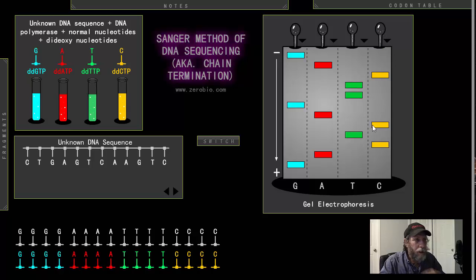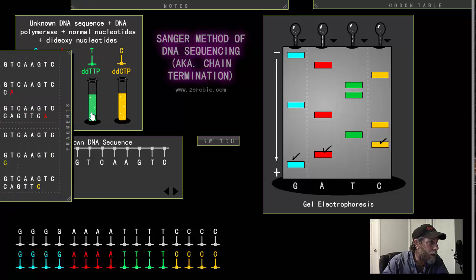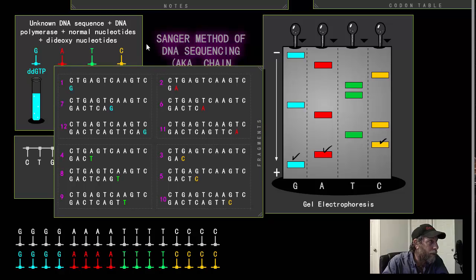And this is what we have. Okay. What you need to notice here is that every fragment of DNA, let me go to a different color, I'll just go to black. Every fragment is at a different position. This fragment went the furthest distance down. This one went the next distance down, next furthest down, and then this one went the next furthest down. Now, I need to bring over my fragment list over here so we can have a look at that as well.